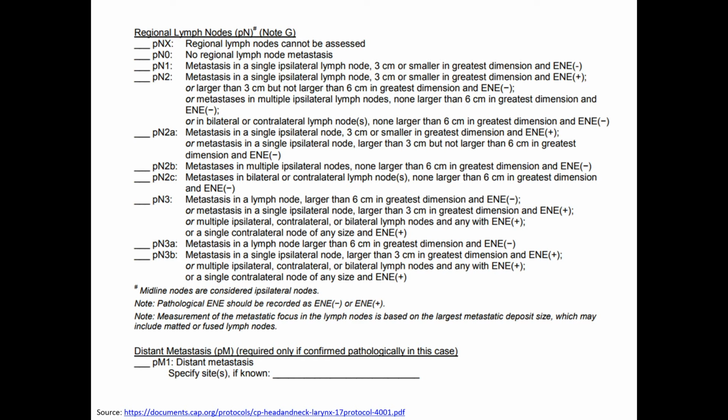From a grossing perspective, they're usually just lymph node dissections. Half the time they'll come out separately, is my observation. It depends who the surgeon is. Sometimes they'll come out separately as a dissection. Sometimes they'll come out with the larynx. On rare occasion, they'll come out with sternocleidomastoid, or they might even go high enough up to get a little bit of submandibular gland. I've seen that once. If you can orient and approximate the levels, that's great. But no one's expecting perfection when they take them out en bloc like that.